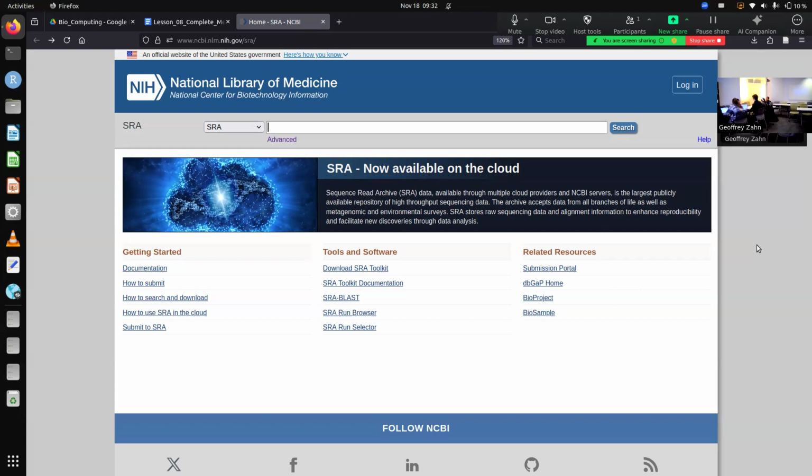Now it's up to you to decide what you want to change. Whether it's the FastQC, right? Maybe you decide we're not going to cut out things that have Ns and whatever. Maybe it's in your SPAdes step. Say we're going to try a different type of assembly where we use larger k-mers. 27, 55, and 127.